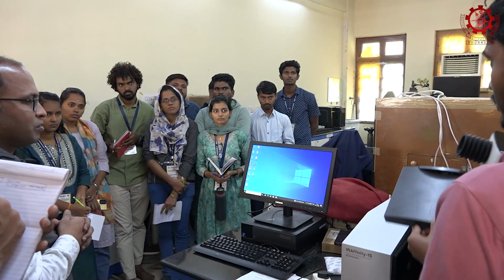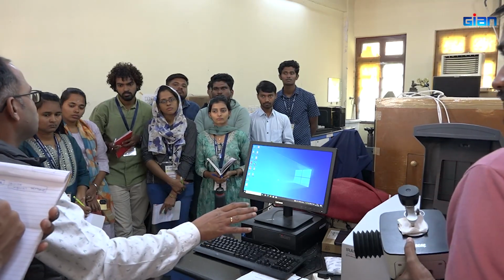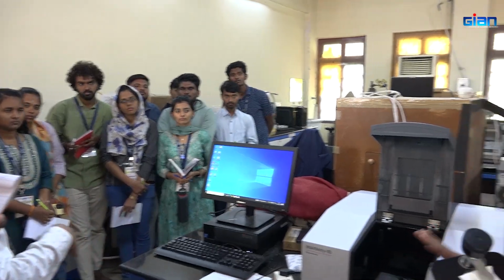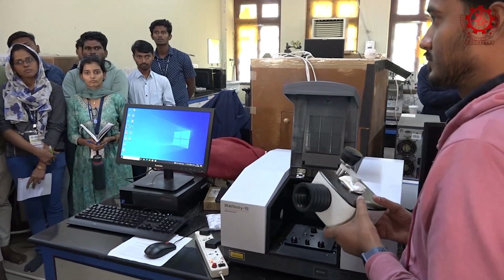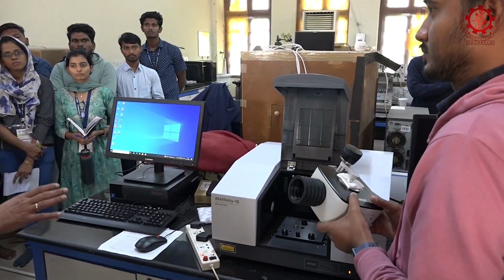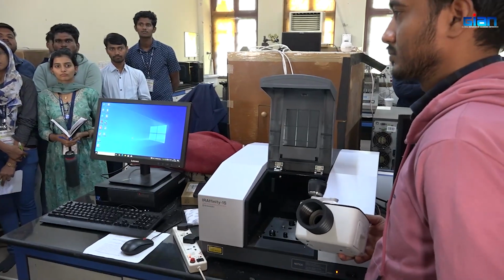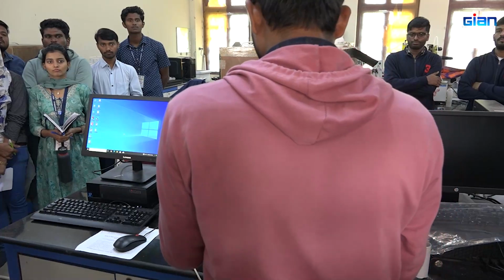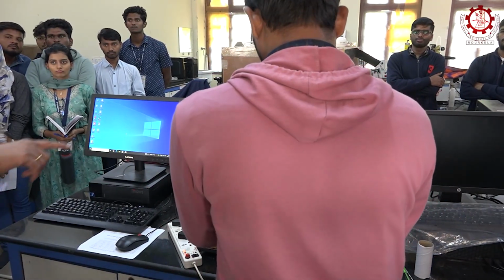This is ATR Pro. ATR means attenuated total reflectance. This equipment costs 15 lakhs, of course depending on other advanced accessories, but still this one is enough for characterization of all molecules that we need. Yes. Sample chamber. I think everybody can see here.